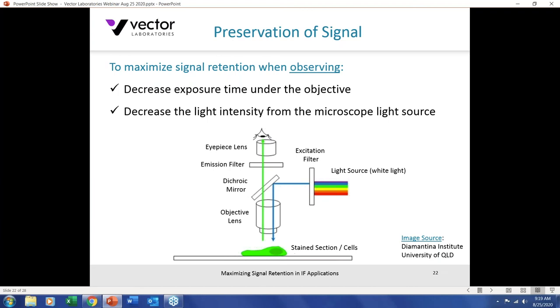A couple of tricks to retain maximum signal when observing specimens under the microscope: first, decrease exposure time by moving the objective lens away from the target of interest, do focusing and setup, then move back to image the target — this saves exposure on the key area and maximizes signal retention. Another trick is to decrease the intensity of the light source, which prevents photobleaching but also compromises maximum signal intensity from the fluorophore. Be aware of that compromise.